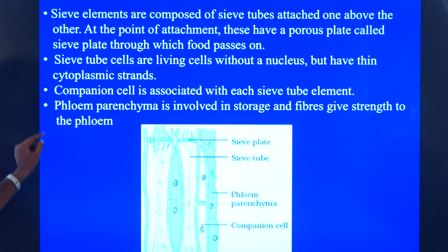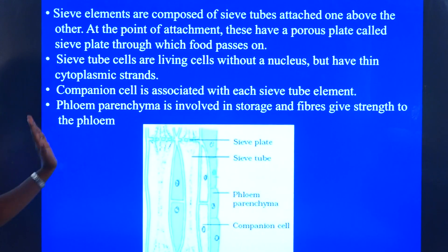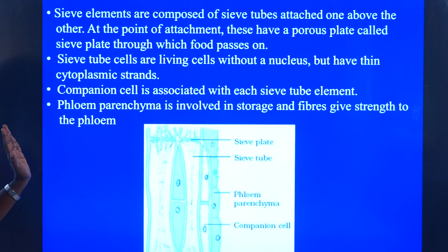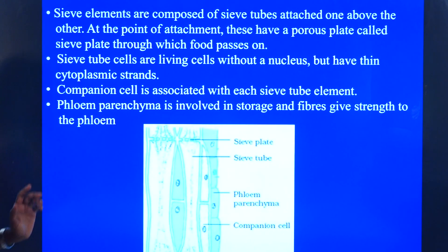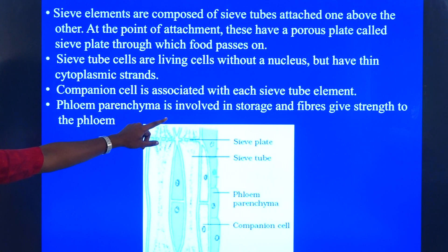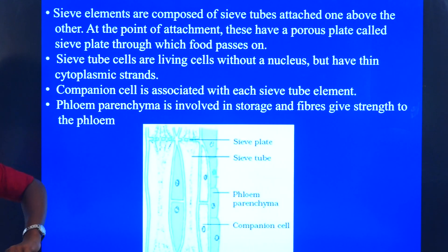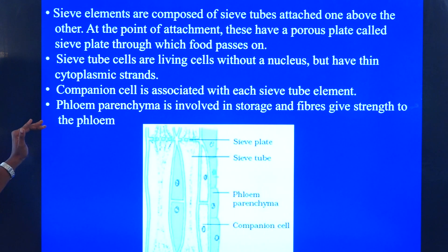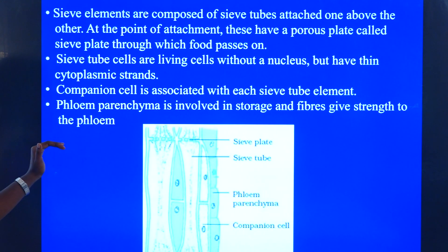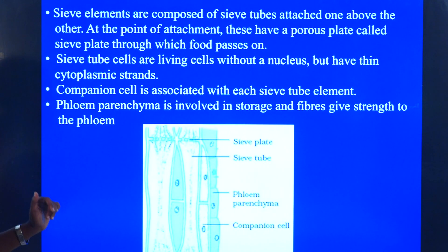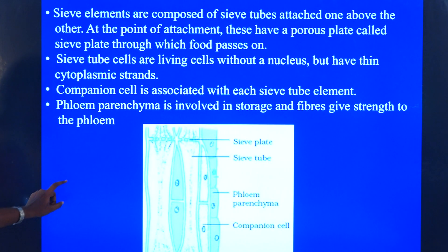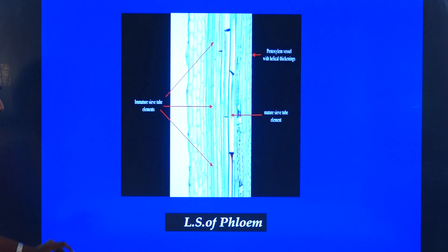Phloem parenchyma is involved in storage, and fibers give strength to the phloem. The phloem parenchyma is found beside the sieve elements and companion cells, and helps in storage. This is the microscopic view of the phloem.